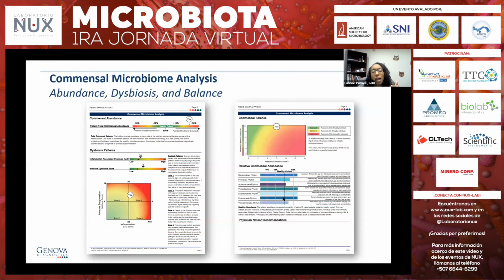The middle dark line is where we found the healthy cohort to be, and the colorful line is where your patient lies. And on the right-hand side, we provide some information. For example, the Bacteroidetes phylum, if it's high, we do see it high in individuals who have more of an animal-based diet. So we do provide insight into when we see it high, when we see it low, based in literature, what different dietary foods or things might influence it.